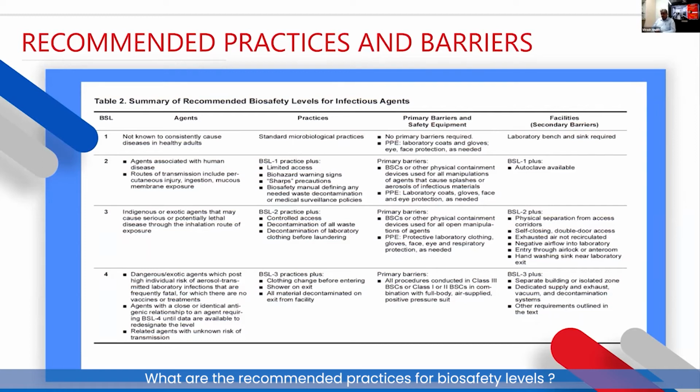When it comes to BSL-4, it is very much necessary that the clothing gets changed before entering. Now, this is a practice which we have introduced even in BSL-3 because we do not want contamination of the garments which people wear when they move out of the laboratory. So it is standard practice even to do a clothing change in BSL-3. Shower on exit is a must-have, and all material has to get decontaminated, whether it be clothing, equipment, or any waste material, everything needs to get decontaminated.